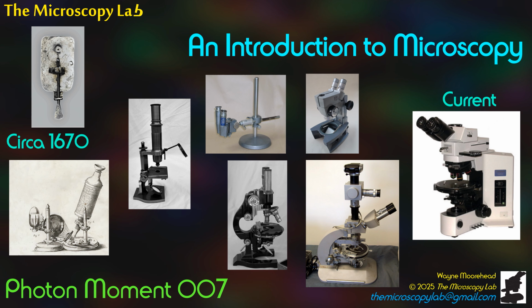Now that you know how to clean your area, prepare for your sample, properly open a sample package, as well as package and seal a sample, we can finally begin learning about the theory and operation of microscopes to identify particles through the microscope. Title slide, please.